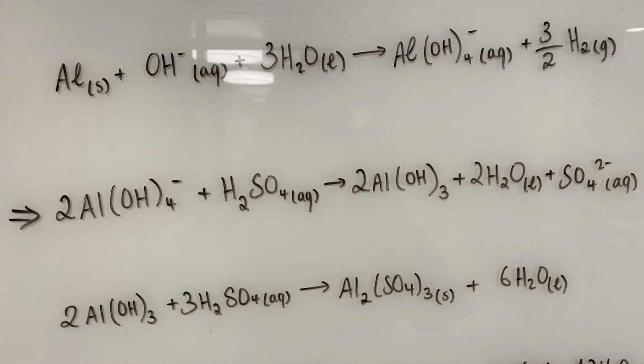Aluminum hydroxide is an amphoteric species, meaning it can react with both acids and bases. This property is demonstrated as the addition of sulfuric acid to the newly formed solution leads to the formation of Al(OH)3 precipitate. This is due to the limited solubility of alum under experimental conditions. When the acid was added, the formation of a white foam-like substance was observed. However, after stirring, it dissolved back into a clear solution.